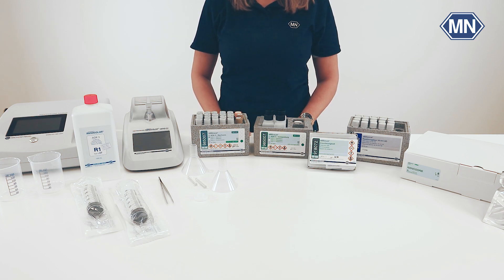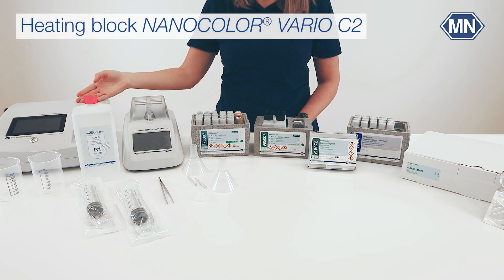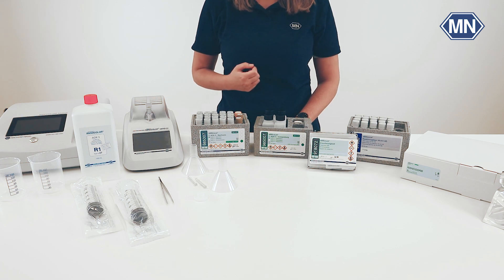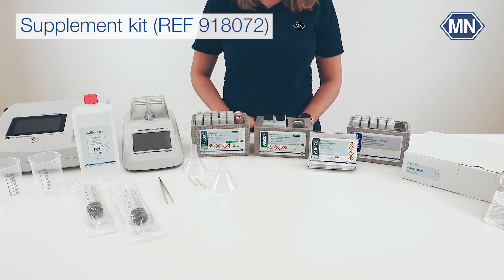In addition, you need the tweezers from our starter set, the photometer and the heating block. If your sample exceeds a COD of 50 mg per liter, we recommend our supplement kit for the decomposition step. If you do not need the kit, you can simply skip this part of the video.